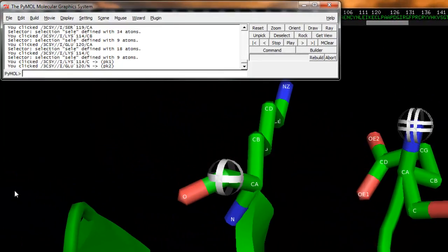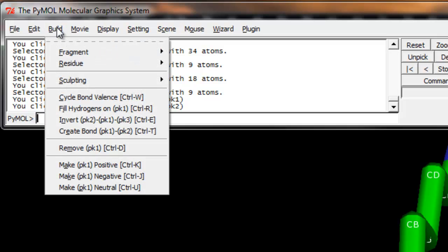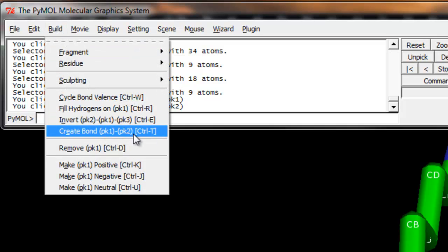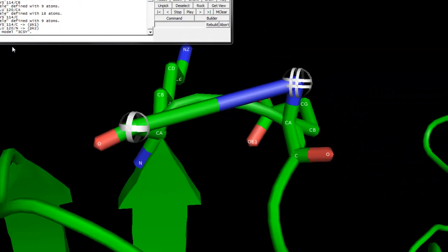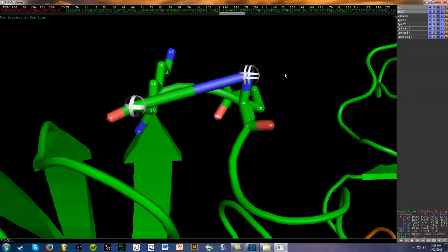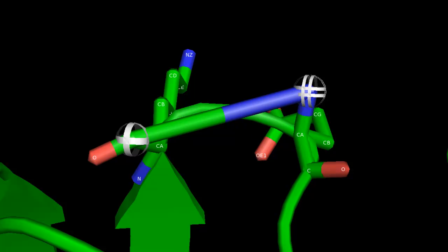Next, we're going to go to the menu, and we're going to select build, and we're going to create bond between PK1 and PK2. And we're going to select that, and boom. We have a bond, and now the structure accommodates it by forming the cartoon loop right there in the middle. So now we get out of editing mode by clicking it once again into viewing.